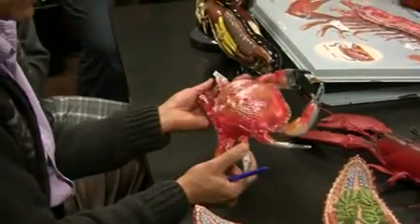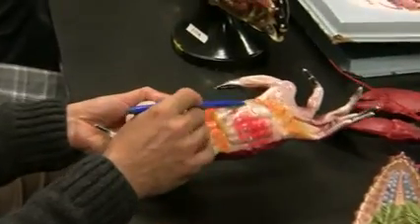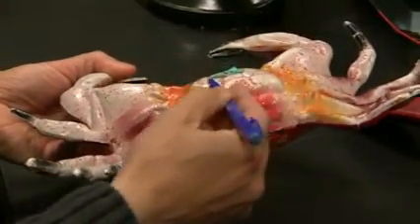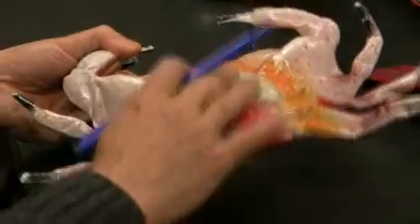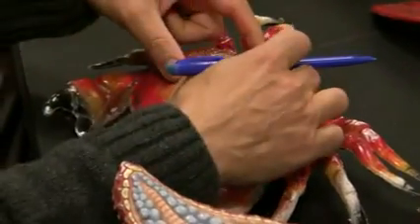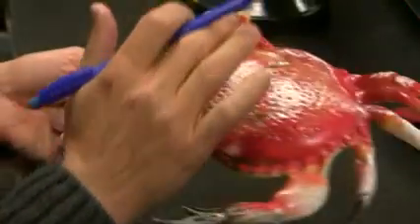Carapace. These are walking legs, and these would be like what would they be? Sternum, yes. Sterna, plural, you're right. Either one you write down, I'll give you credit. Sternum. That's the only thing you should know on this side. This side you have carapace. They do have compound eyes and so on, but on the oral, ventral side of the animal, the only thing you should know is the sternum. That's all I have to say about that.